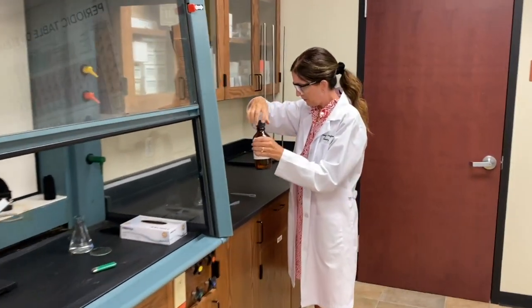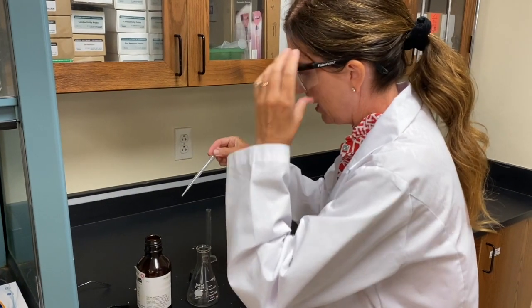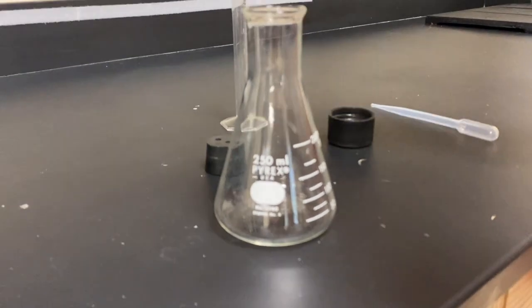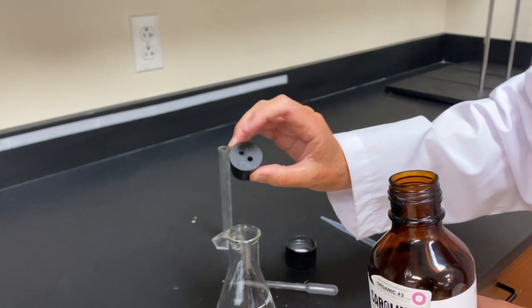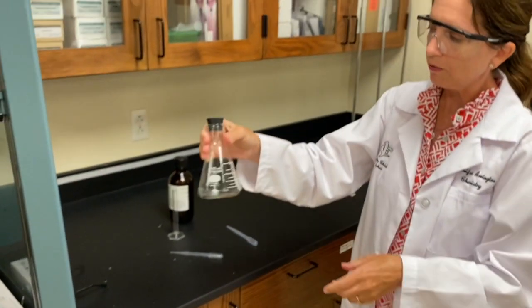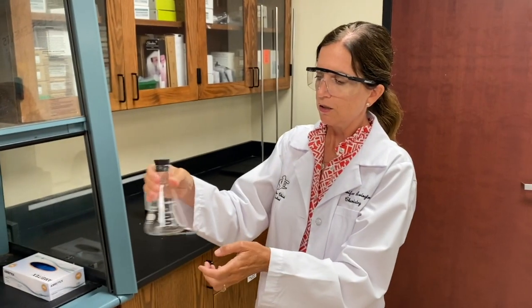So I'm going to take some of this hexane — two to three mils of it — and we're going to put it into this Erlenmeyer flask. Now I have a stopper. It's going to stop most of the vapor from coming up, but notice I have holes in the stopper, and that's on purpose because this stuff is so volatile that if the pressure builds up it could technically blow the stopper off, and we don't like things blowing up if we don't mean for them to blow up. So now I'm just swirling this around, waiting for it to vaporize.